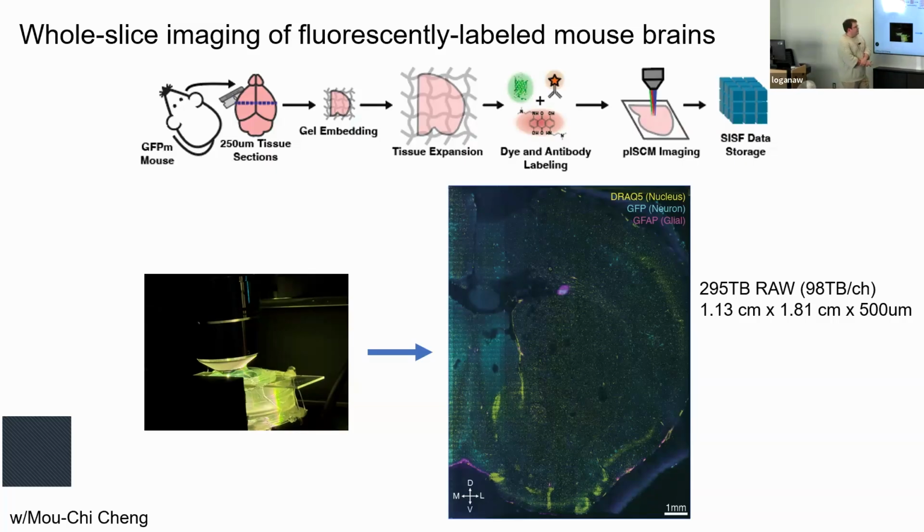And because we're using expansion microscopy to make the sample physically bigger, it represents centimeters of imaging space, but each pixel is like 100 nanometers. So those are the 2 scales here: you have a centimeter-size image, but each pixel is 100 nanometers.